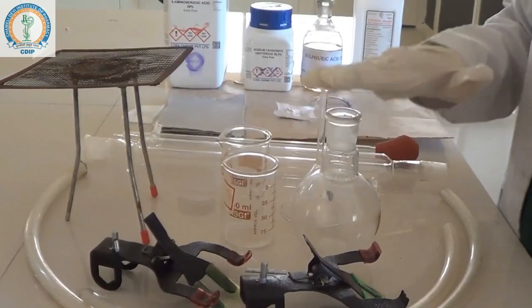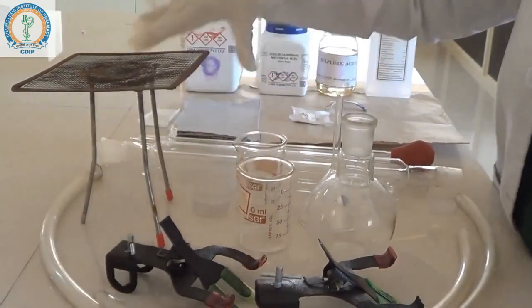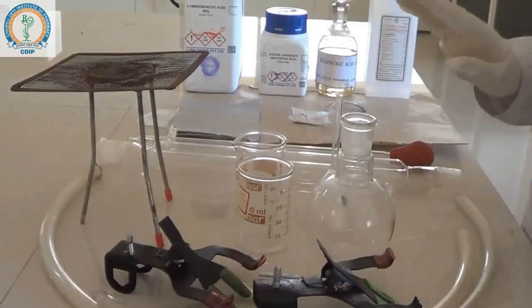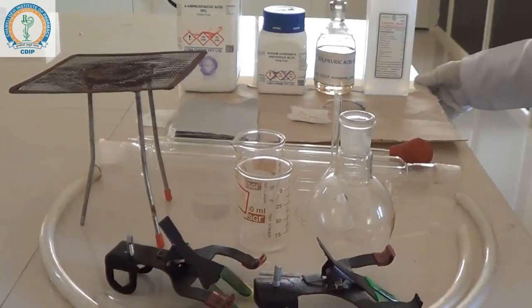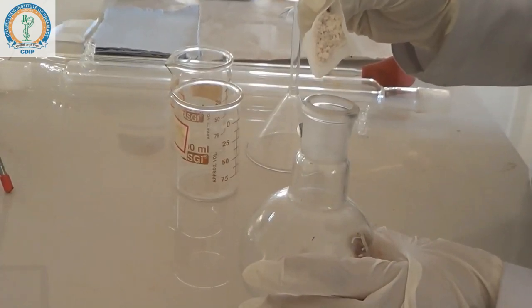We also need a round bottom flask, tripod, wire gauze, clamp, and glass rod. Now we are going to take a weighed amount of para-amino benzoic acid in the flask, which is 0.4 grams.